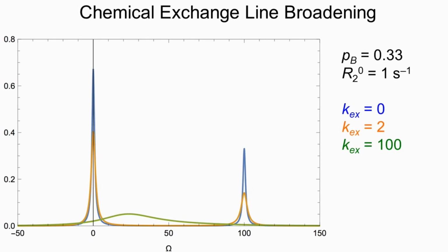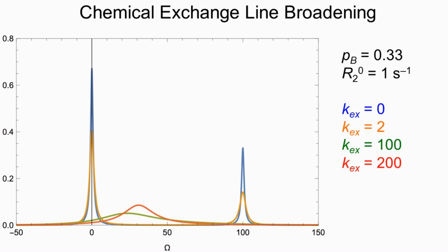So this is called intermediate exchange or coalescence. And in practice, the peaks frequently just disappear from the NMR spectrum altogether. And one has to find new solution conditions in order to bring the peaks back. Now I make the kinetics faster, and a line starts to grow in at the population average position, and now we're starting to enter the Redfield limit.